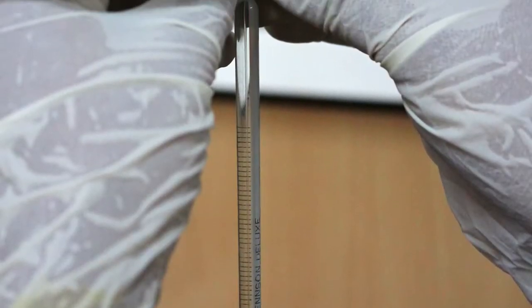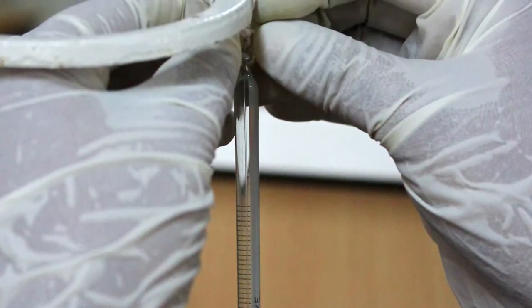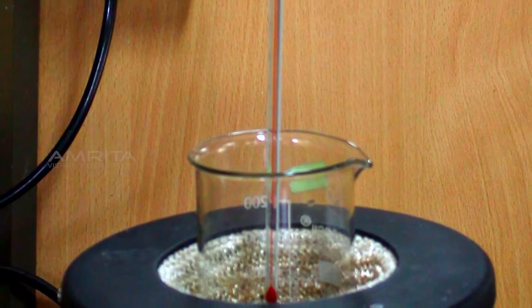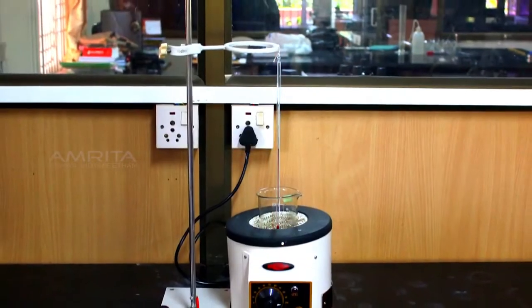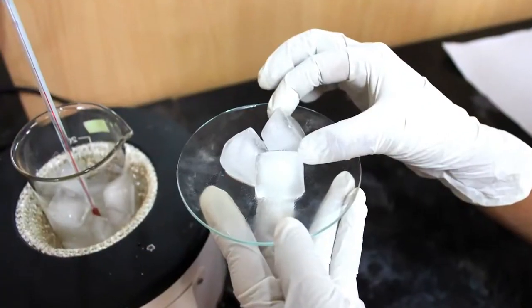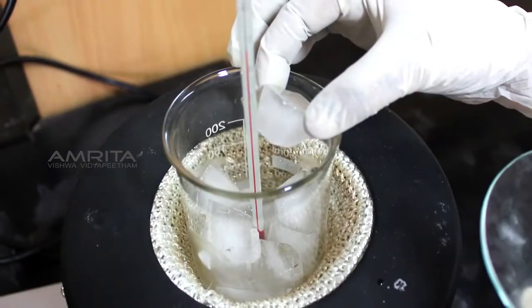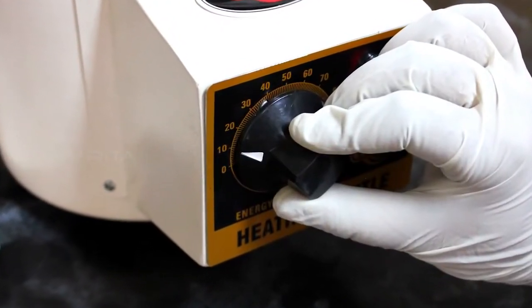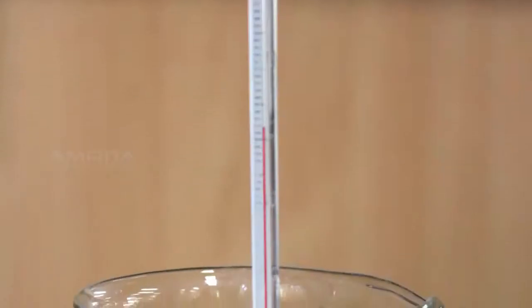Procedure: First, suspend a thermometer using a clamp stand so that its bulb is at the center of the beaker, which is placed inside the heating mantle. Take some ice cubes and put them quickly in the beaker. Start heating the ice cubes by increasing the temperature of the heating mantle.